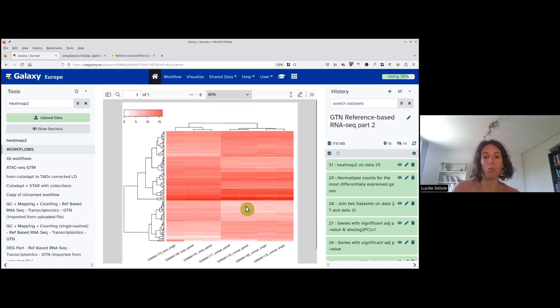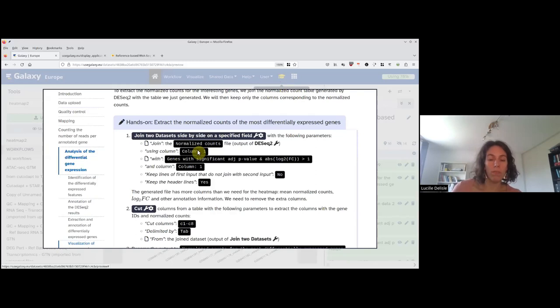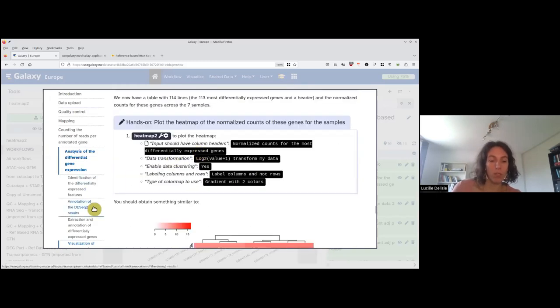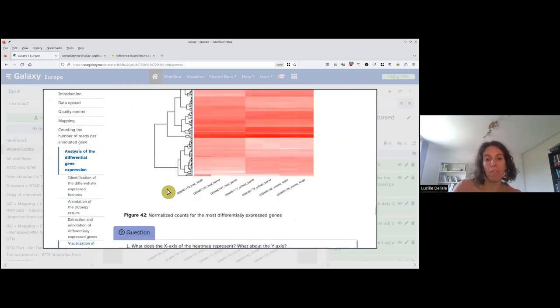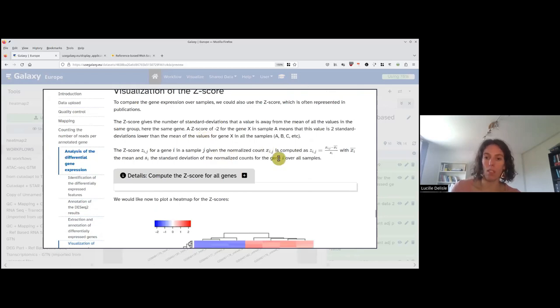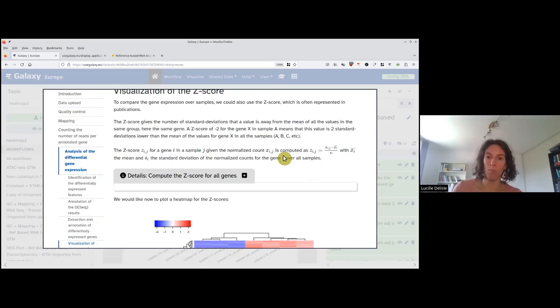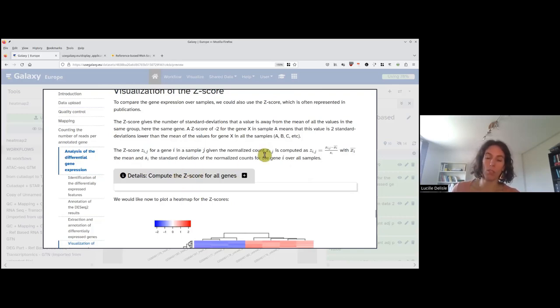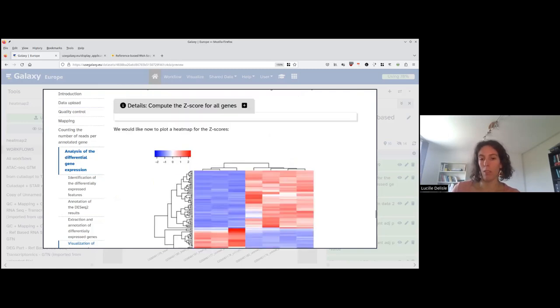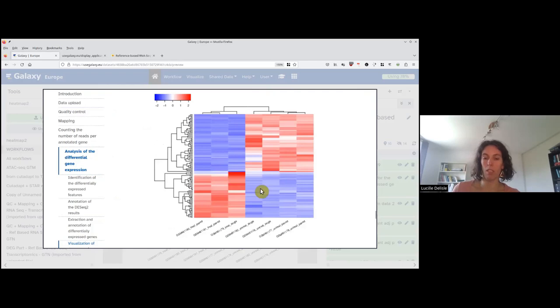If we want up-regulated together and down-regulated together, it's better to work with z-score. A z-score is a measurement of how far a value is from the mean, normalized to standard deviations. A z-score of plus two means two standard deviations above the mean; minus one would be one standard deviation below. Heatmap2 allows displaying the z-score directly, and we would have a cleaner separation.